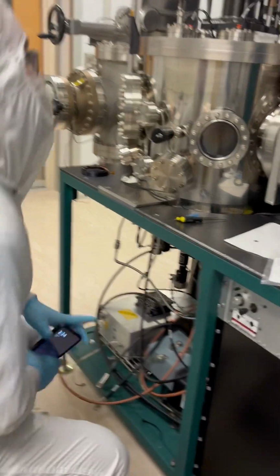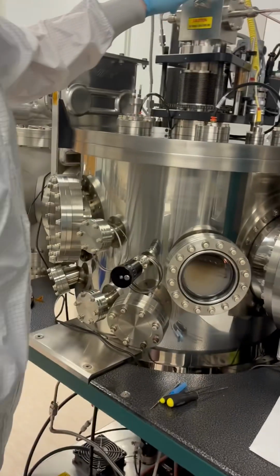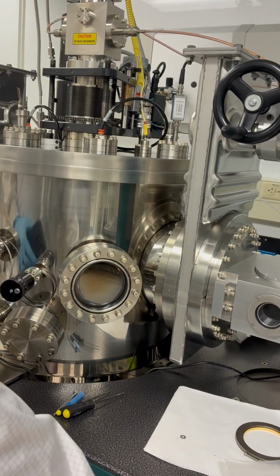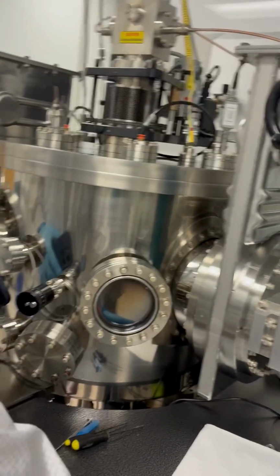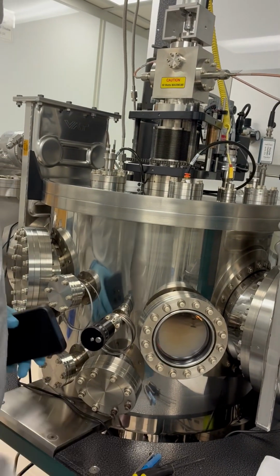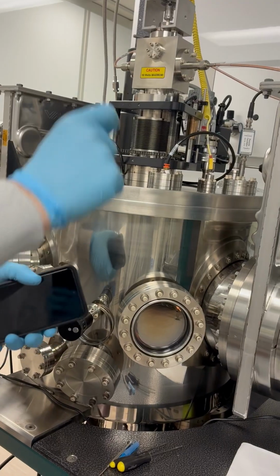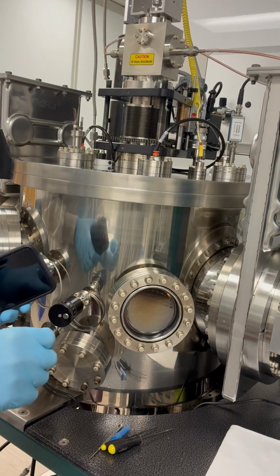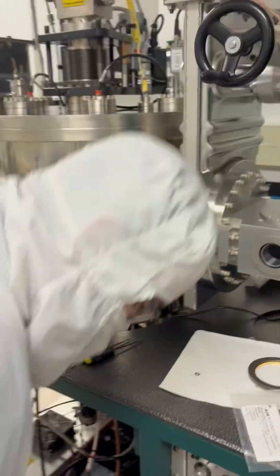There we go. So, remember the locked-in position? What was it? Two markers aligned, two markers lined up. So I'm going to want to go back to that position. Because now if I picked it up from this position, I should be able to put it back down in this position. Make sense? Okay.